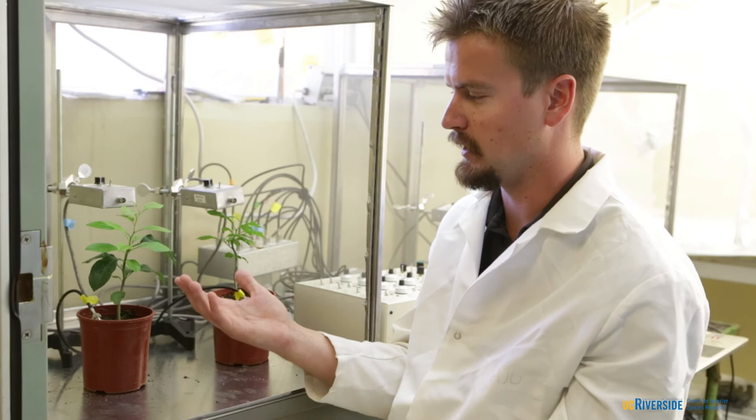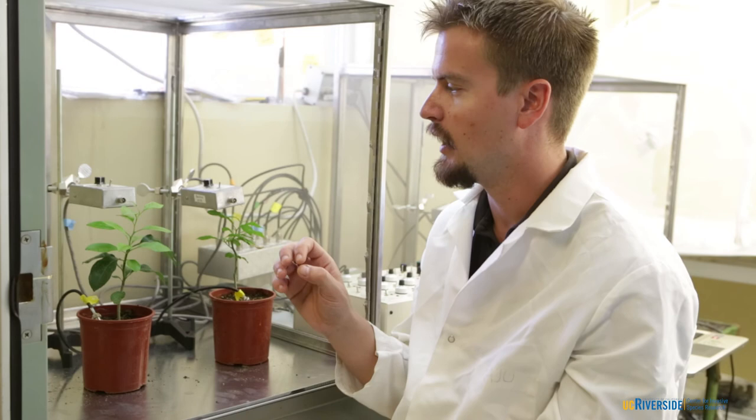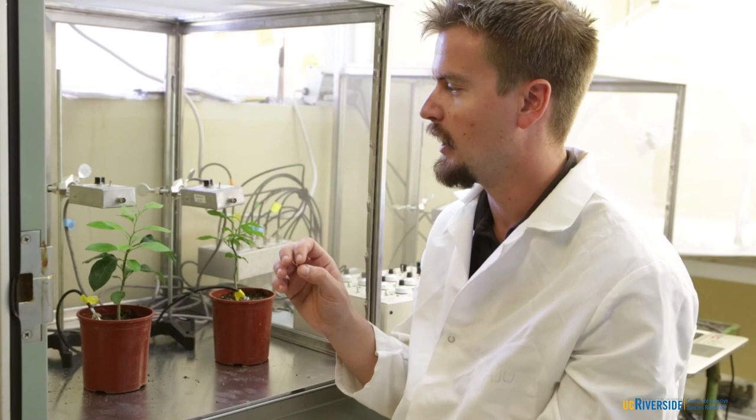And so we can actually treat them with different treatments, hook them up to this machine, and look for differences in their feeding behavior or patterns through those different waveforms that we actually pick up and produce from this process. And we can see if it can actually help stop the Asian citrus psyllid from actually transmitting this disease and actually perhaps in the future control their populations.